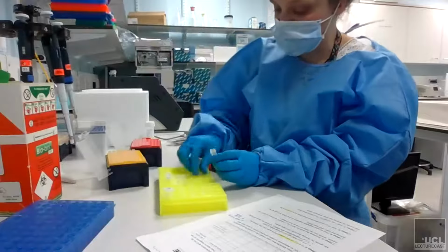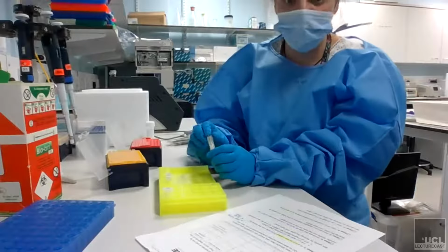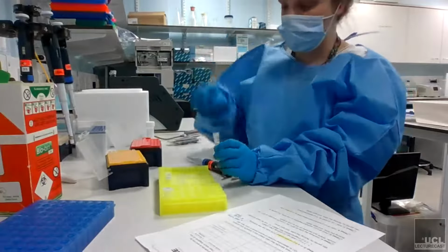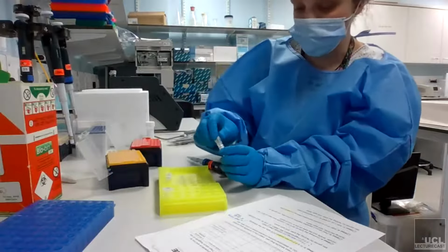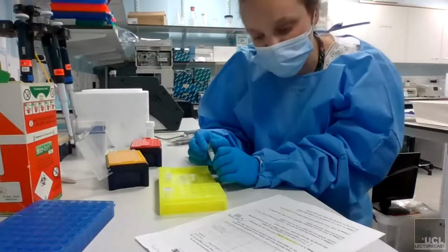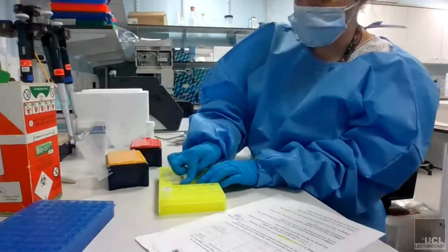I forgot to add at the beginning, in the table at the top of this protocol, it says to spin down all of your tubes because they get frozen and they can get sort of dislodged at the top. So what I did before I put them on ice is I also spun them all down so that all of the sample is at the bottom. And you can also pipette to mix, or you can sort of gently flick. Some of them you can vortex, but others not. So as I say, it's just worth checking on the sheet what to do with what.